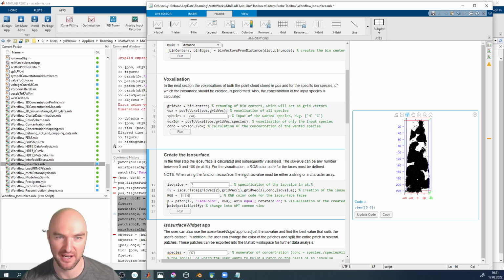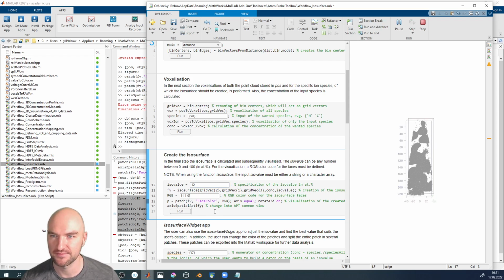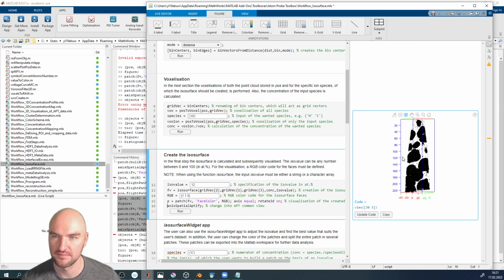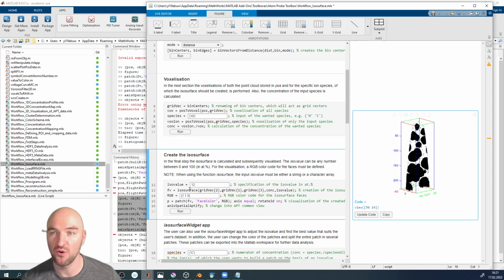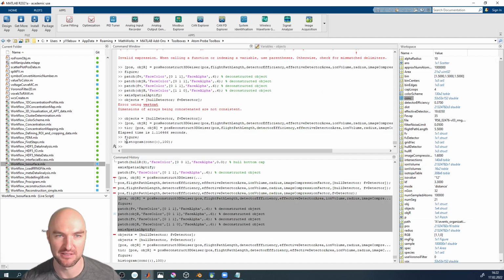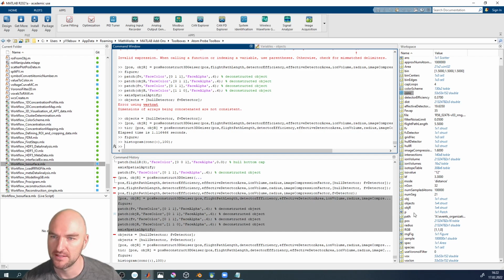Maybe we'll just move it to a higher value, maybe 12% or whatever. Doesn't matter all that much. But now, I shouldn't have called the other variable FV, because now we don't need the plane anymore. Anyway, we've overwritten our variable that was called FV. Now we've got the isosurface, and I can actually do the same thing as I did before. So our variable FV is now our isosurface.